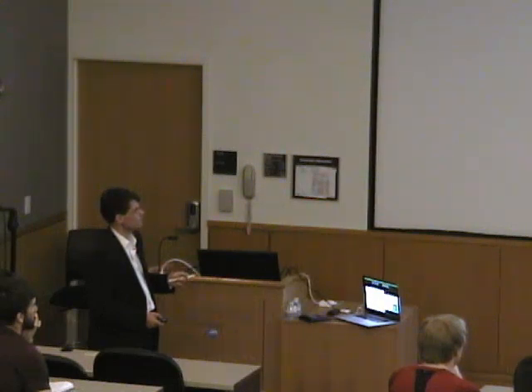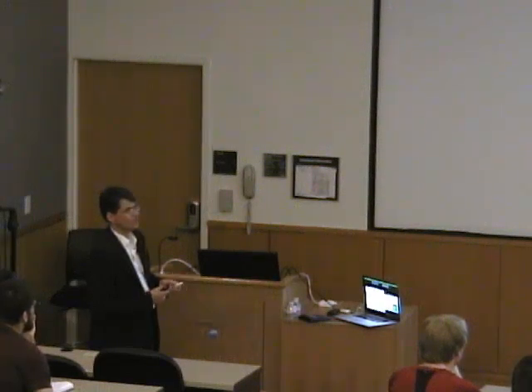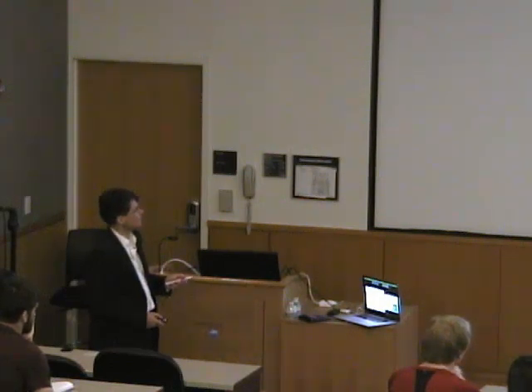But what's happening is that at the active site, a hot species forms, like a high-valent iron center, that attacks the substrate and finally turns over. All of this must be subject, say, to kinetic studies, freeze quench, stop-flow studies, and so forth. But what the MCD has given you is an experimental picture of these initial reaction steps.